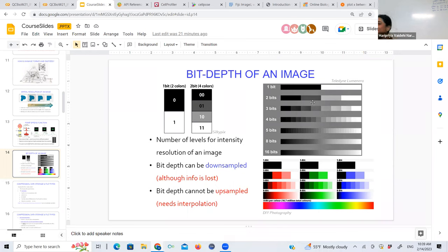Yeah? We're making an image more refined. You just start taking averages between 2 points and manipulate it that way. Yep. So we're going to go into that a lot in depth tomorrow, like what is kosher and what is not. But in general, you can do all this averaging stuff, although that doesn't necessarily give you better signal. It just gives you better signal to noise ratio by reducing your noise. Nothing can give you more signal than you've collected.